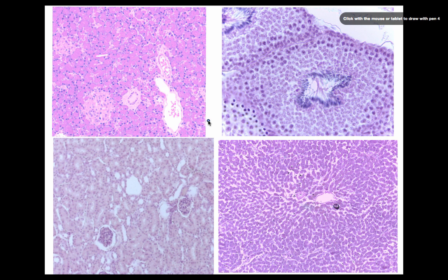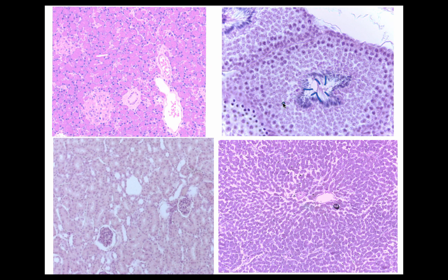Here's a comparison of different slides. The seminiferous tubule up close may look similar to liver lobules, so make sure if you think it's the testis that you are looking for spermatid tails in the center — the central vein obviously won't have those. The liver and pancreas also look similar in their staining and cell arrangement, especially when there's an arteriole that looks kind of like a central vein. So what you want to look for in the pancreas is those nice pink islets of Langerhans — you won't see those in the liver.